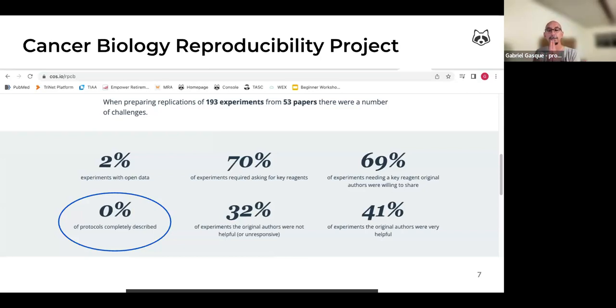This is caused, among other reasons, because people move from labs. Students graduate and leave, postdoctoral researchers become faculty elsewhere, and so on. And traditional paper notebooks can be damaged, easily misplaced, and lost, and are difficult to search to find the most up-to-date version of a protocol. Therefore, we thought that a cloud-based system for the proper storage and exchange of detailed experimental protocols was needed.